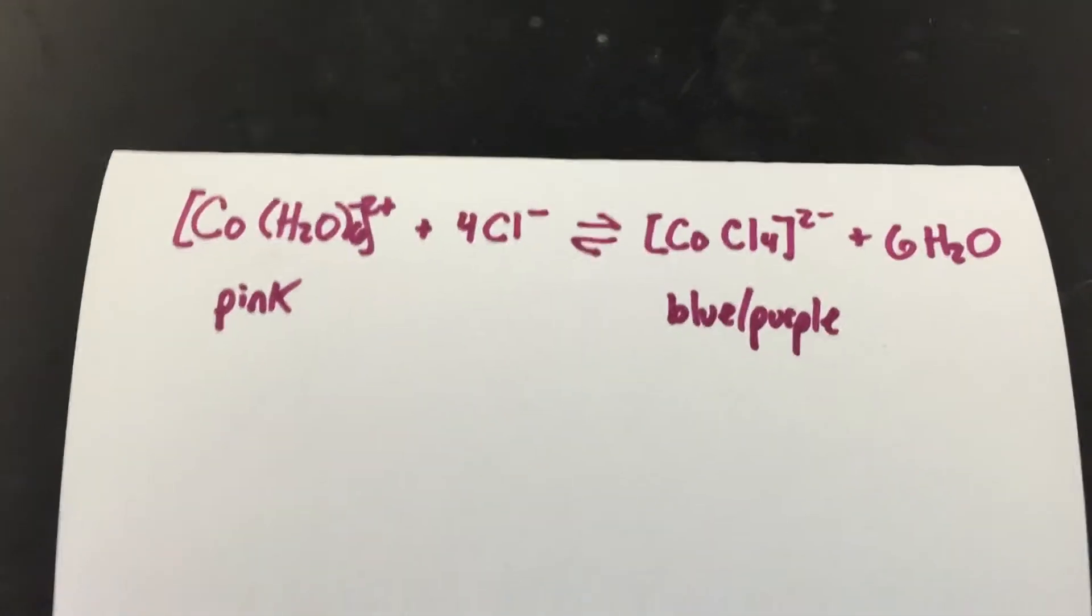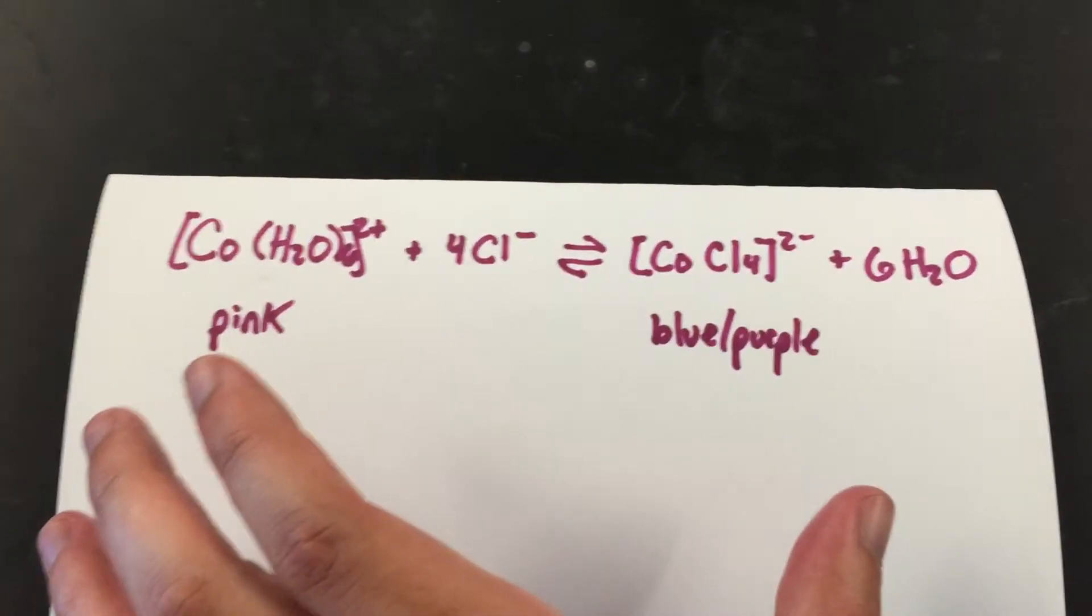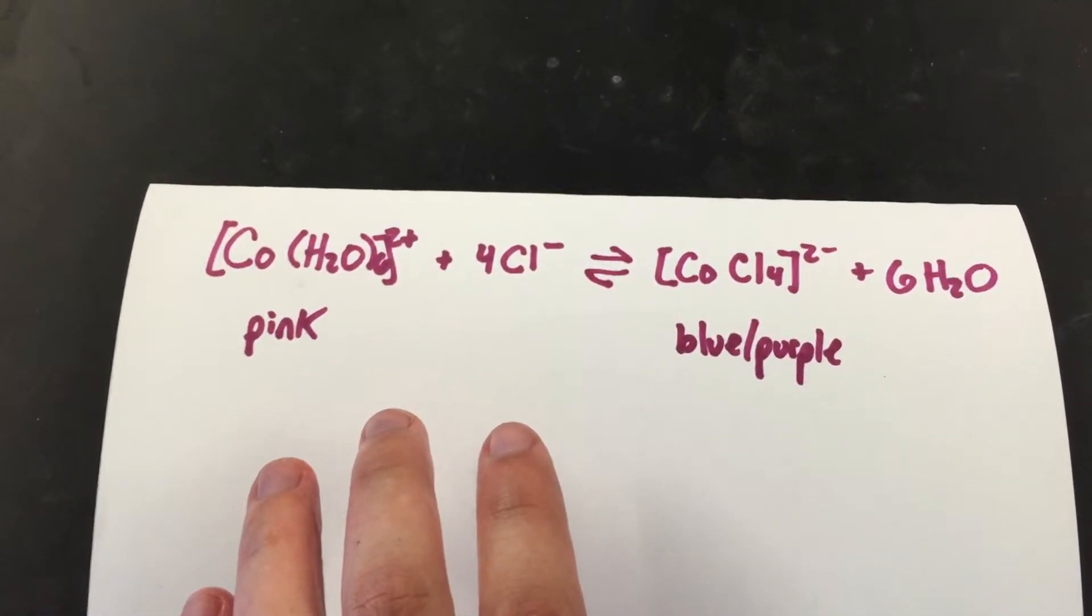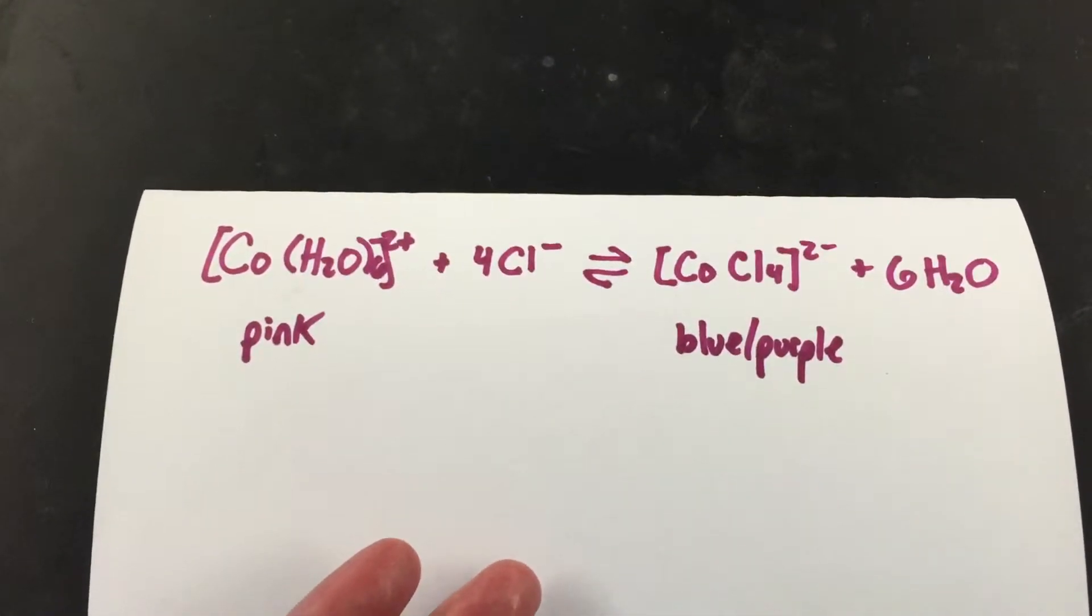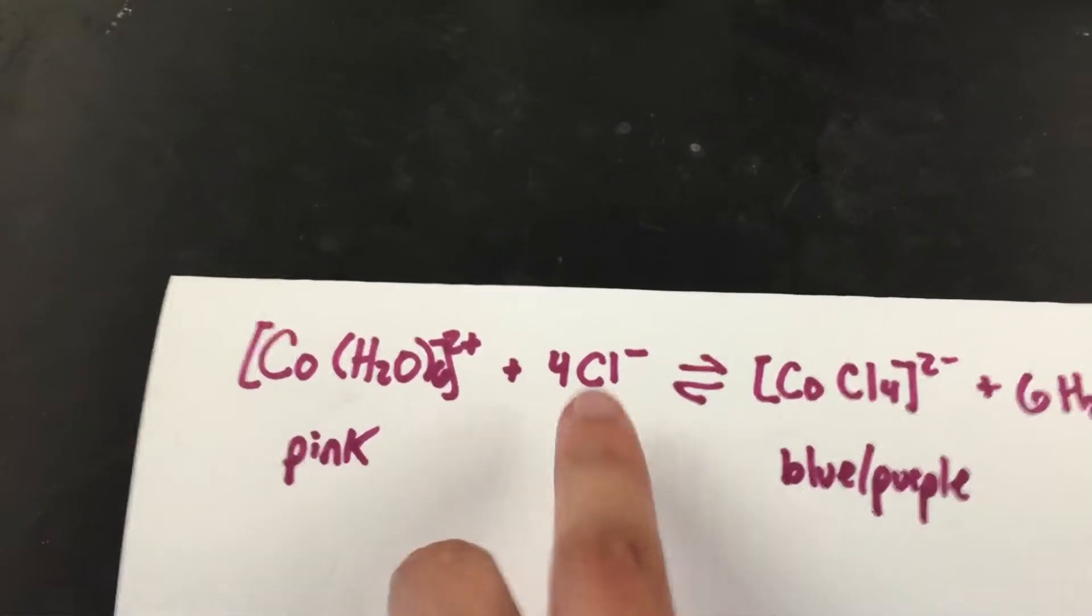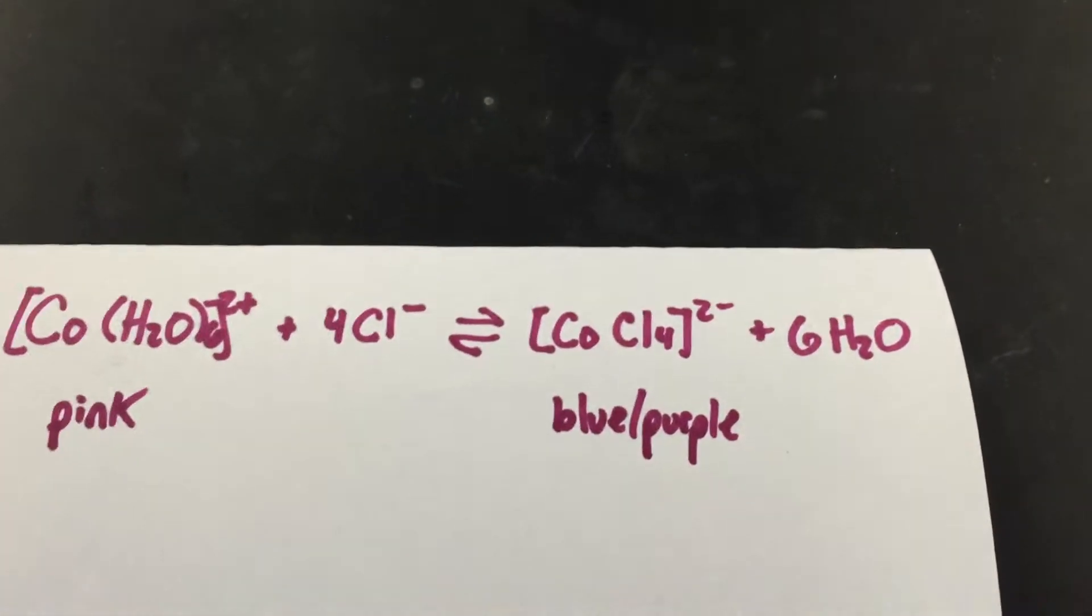What I have here is an equilibrium between both of these complexes. I can adjust or change this equilibrium if I add more of a reactant or if I add more of a product.